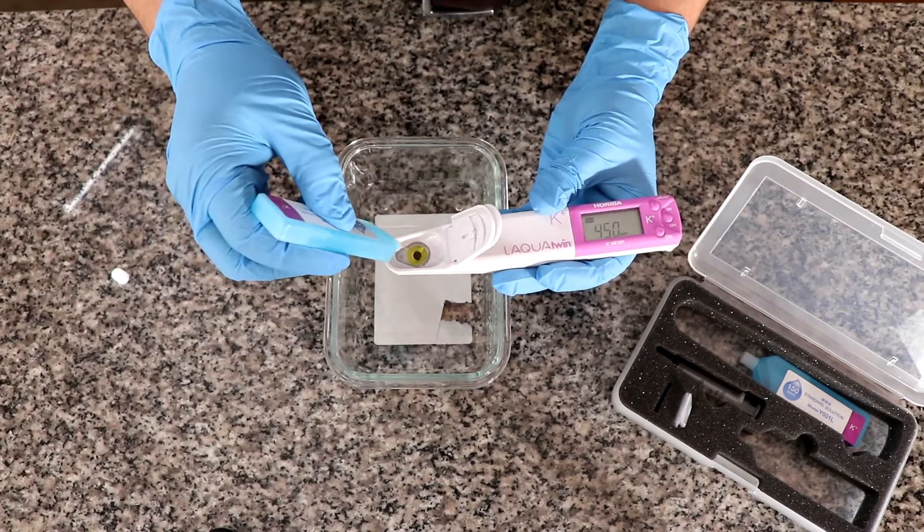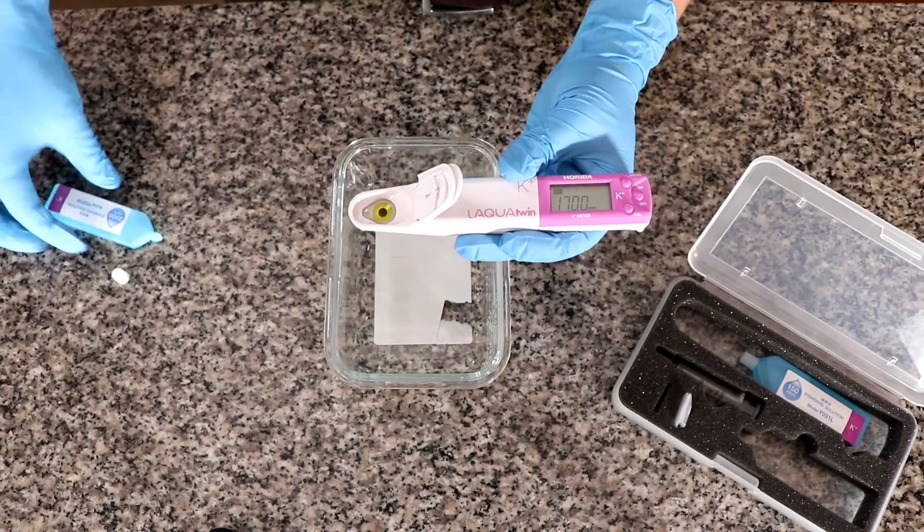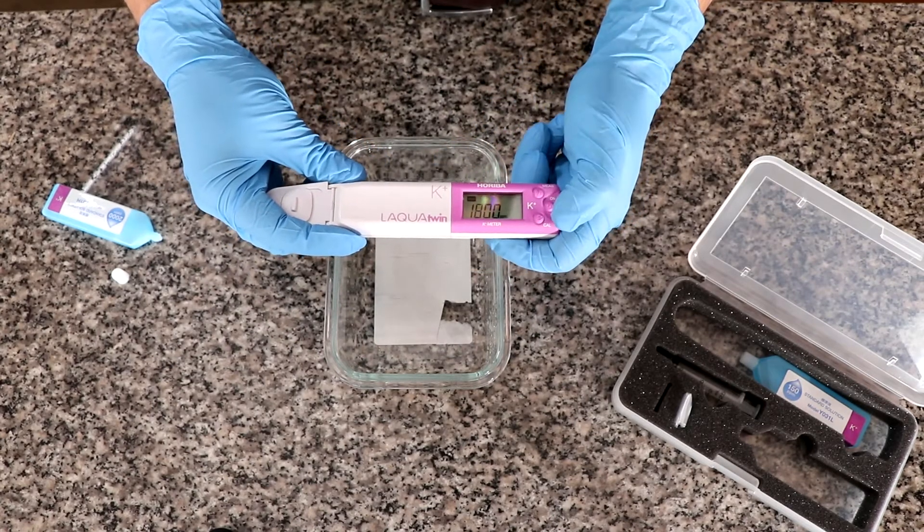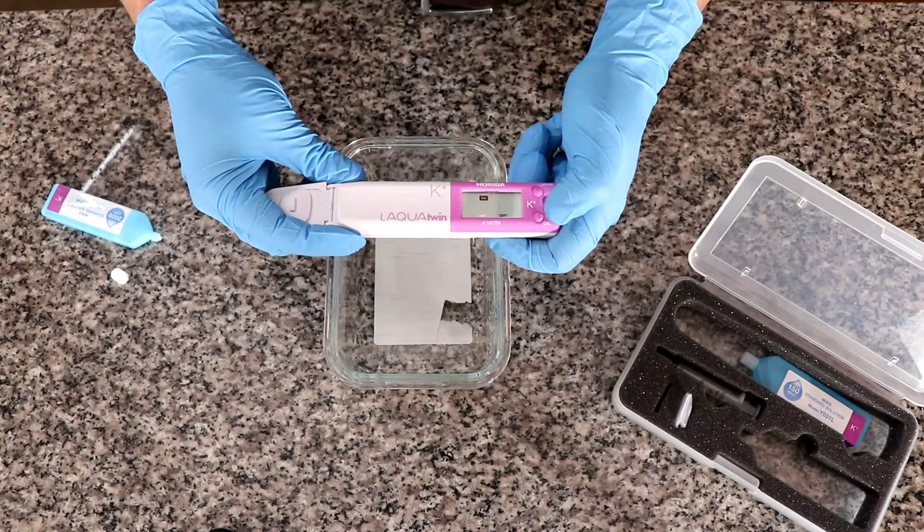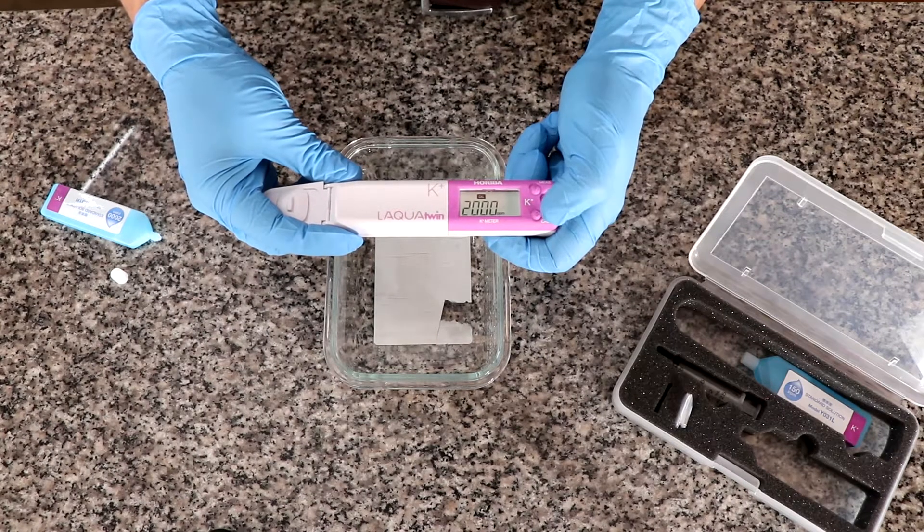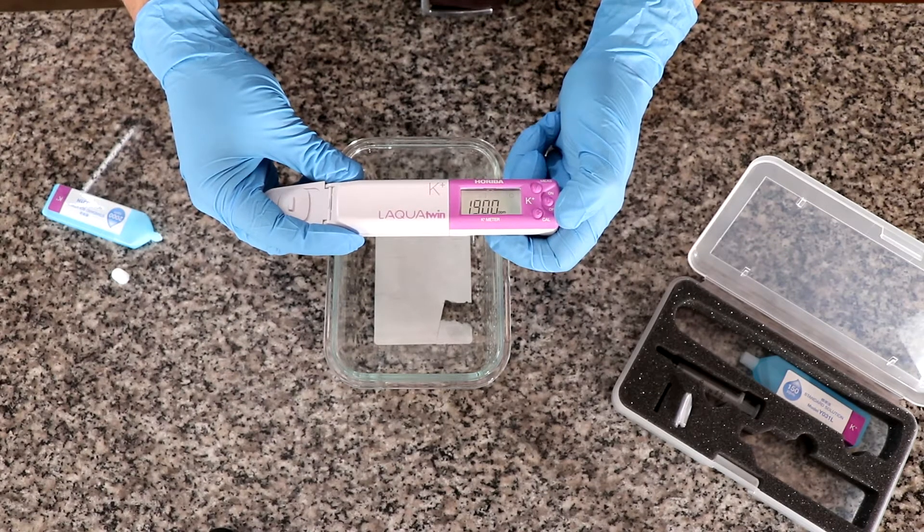And then for the last one I am going to fully cover the electrode assembly. Make sure there's no bubbles. I'm going to cover this and I hit calibrate. It's at 2000, hit calibrate, and now it should change to 2000.